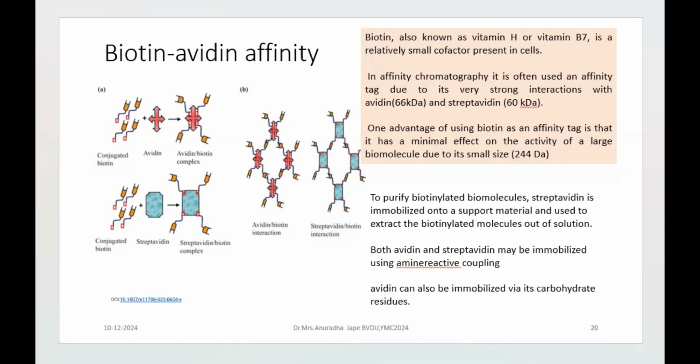So, with respect to purification of biomolecules, the selection and attachment of ligands is to be talked about. When we talk about a ligand, a basic and prior knowledge of the biological specificity of the compound to be purified is a must. In practice, it is frequently possible to select a ligand that displays, say, absolute specificity, that it will bind very selectively and very exclusively to the particular compound. So this selectivity and specific binding is very important.